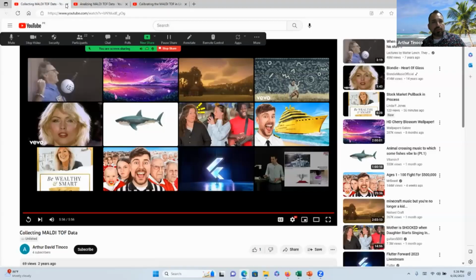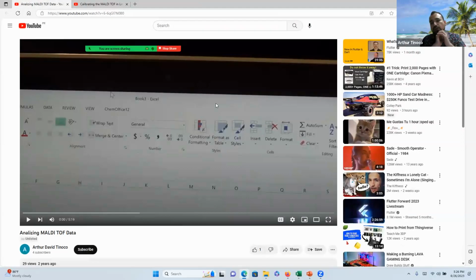Okay, so it's very important, that last point there, that when you collect your data, to send the data by email only. We don't put any memory keys into the instrument. The instrument's quite old, especially the computer, and so send everything by email.